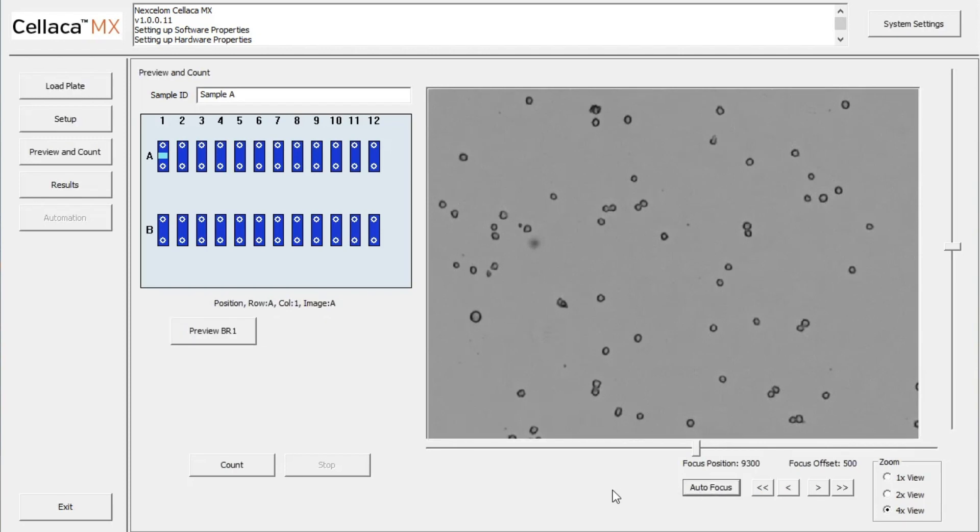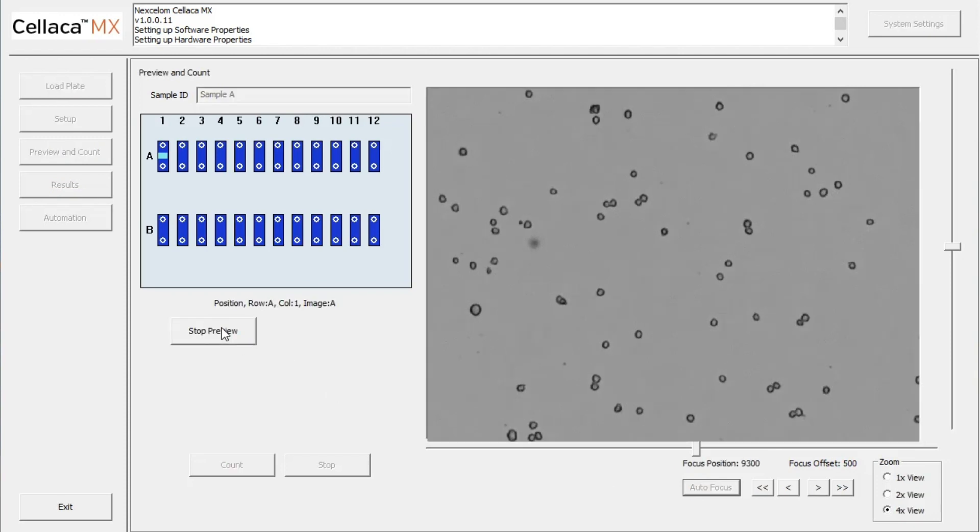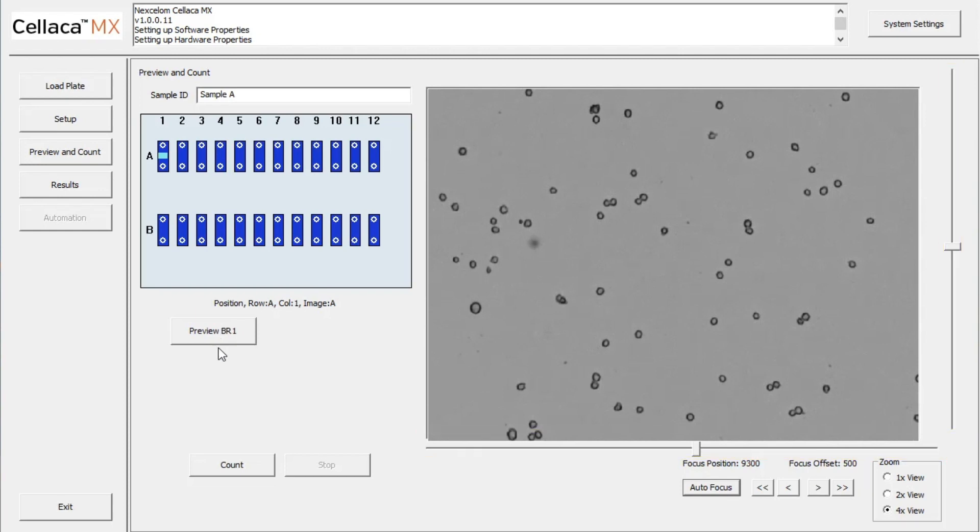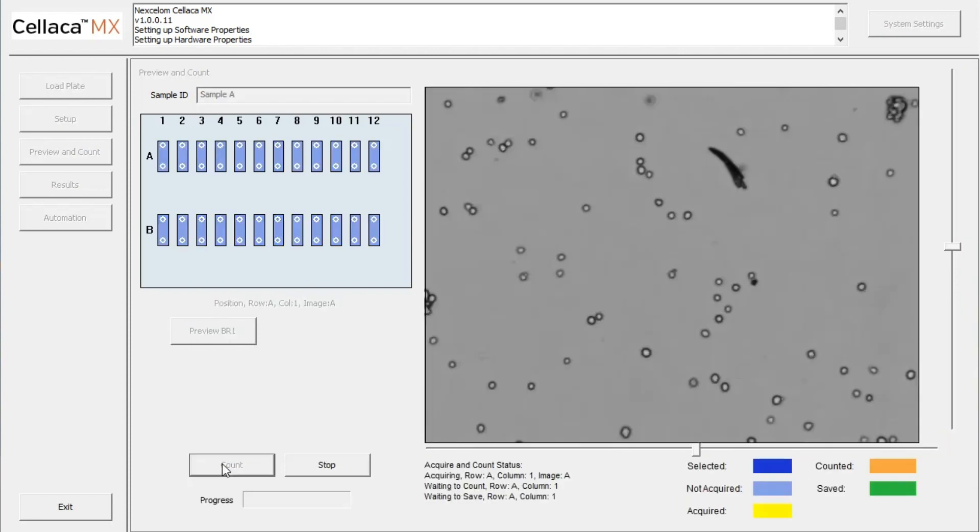With Autofocus complete, we can more closely examine the cells. The software allows up to 4 times magnification, as well as the ability to scroll across the sample. When cells are in focus, click Count.